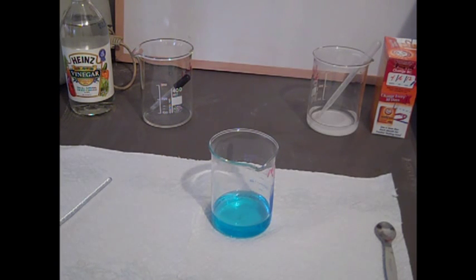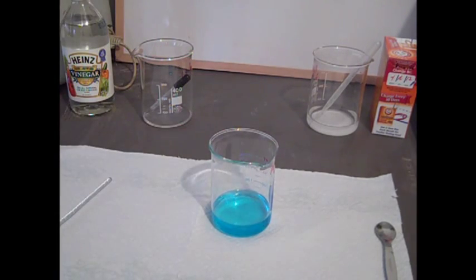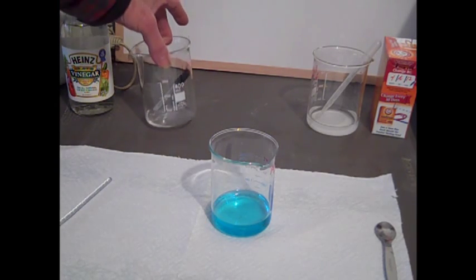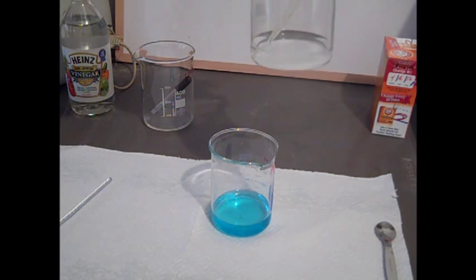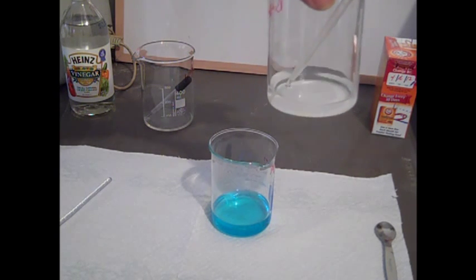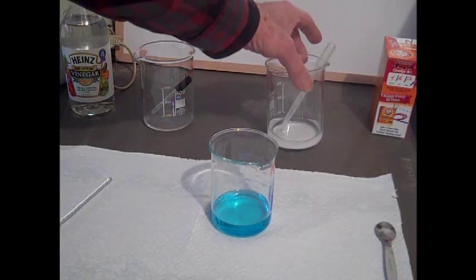Okay, here's the setup we have for the "all things being equal" demonstration on page 219 of your book Joy of Chemistry. We've prepared a beaker of 0.2 molar copper sulfate, and we've prepared some vinegar. We poured vinegar into this beaker, and we've poured water and baking soda into this beaker. You can see the baking soda that's still solid is at the bottom. So we have the clear solution on the top.